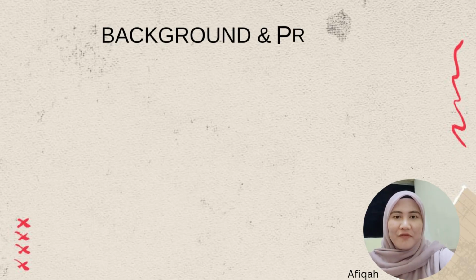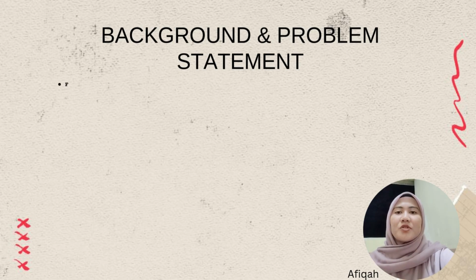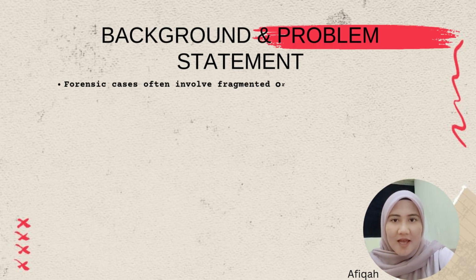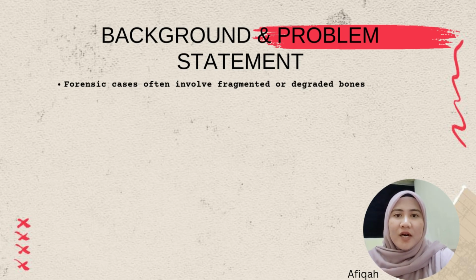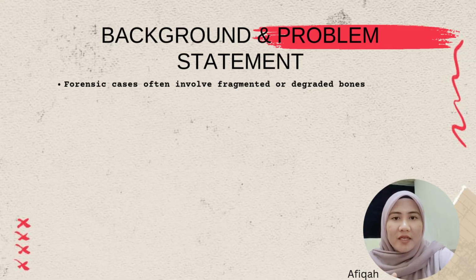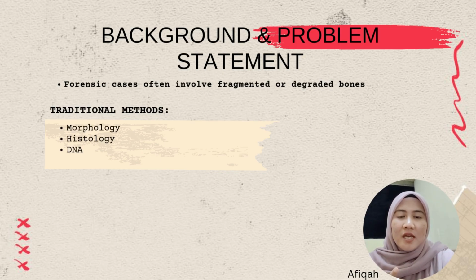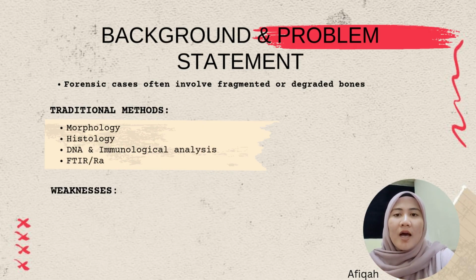Next, I will continue with the background on the problem statement. In the study, we focus on the problem of identifying bone fragments in forensic investigations. In many real cases, the remains recovered are often burnt, degraded, or highly fragmented, which makes traditional identification methods more difficult. The common techniques such as morphological comparison, histology, DNA analysis, and also FTIR spectroscopy are useful, but they come with limitations.